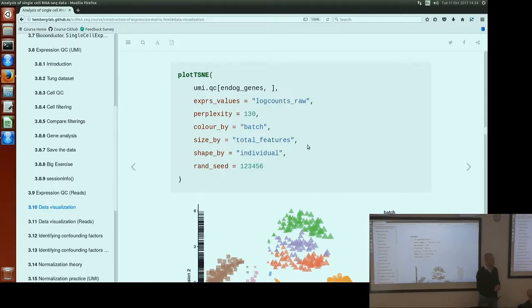They will be different, but not that different. They will still be very similar, right? Yes, you will definitely get more or less the same picture otherwise. Quite often it's just rotated by 90 degrees or 180 degrees, but if you're trying to add annotations or anything to your plot after you've plotted the points, that's going to be a big problem for you. So if you are preparing your data for publication, it's better to fix the random seed so that when you rerun it in a couple of months' time, you will see the same picture. It will not change, right?